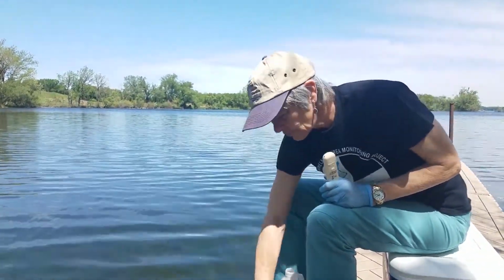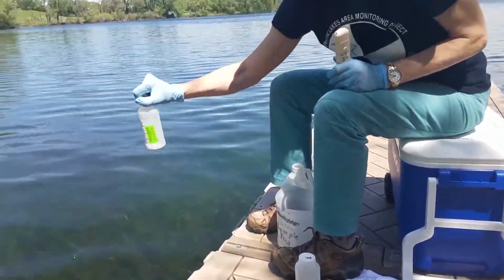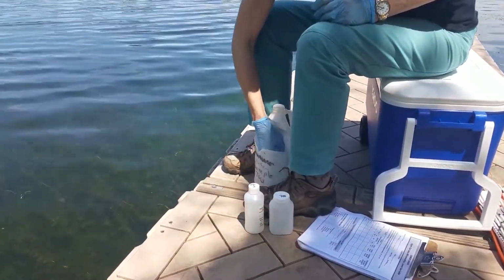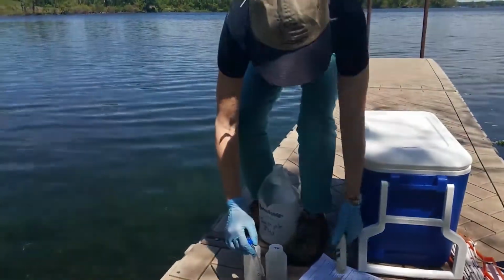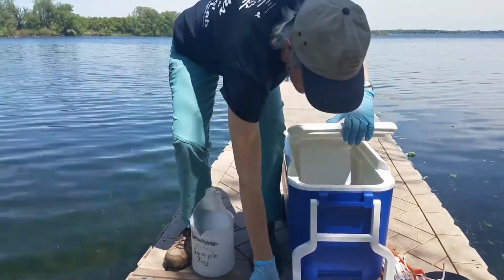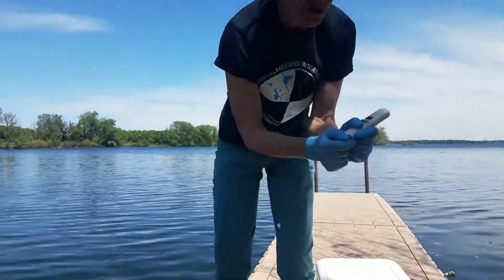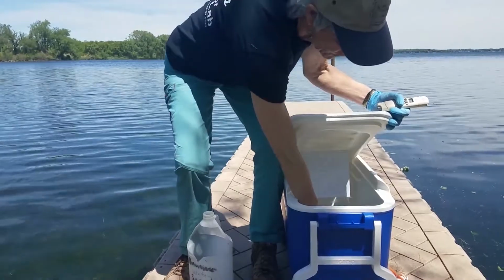You'll have your chlorophyll bottle, your nutrient bottle with the sulfuric acid, keep it upright, and the little vial that you put the microcystin in. Have those ready, but put them in a safe place where they won't blow in the water. For now, I'm going to put these inside the cooler. Then I'm also going to take this cap off and put it in a safe place, which could be in your pocket or inside the cooler.